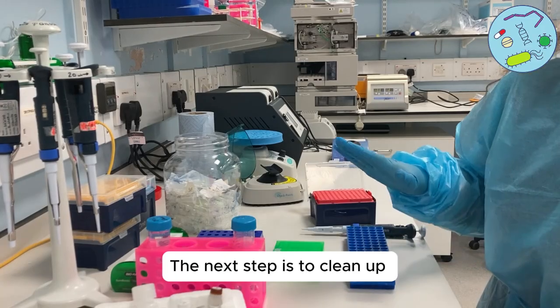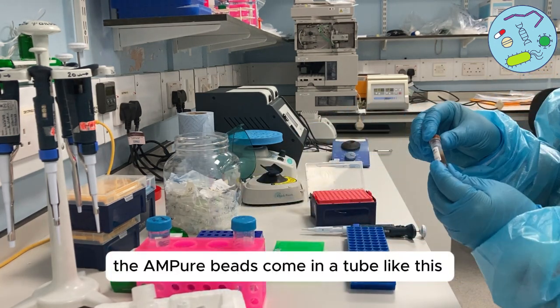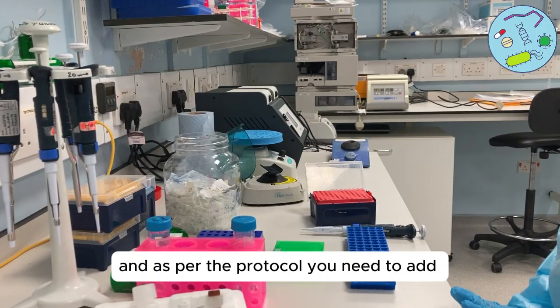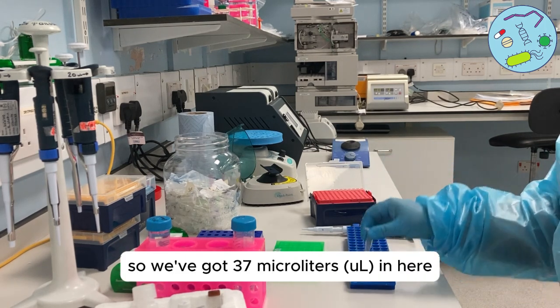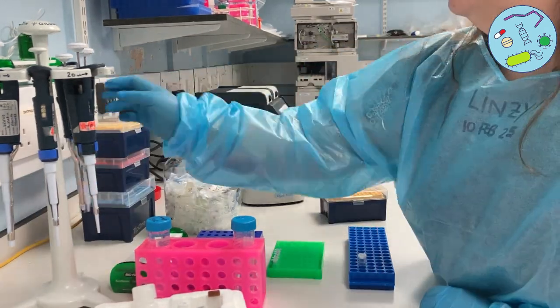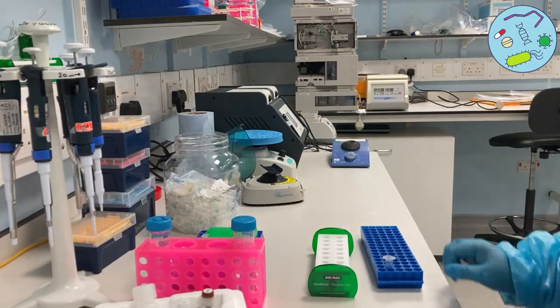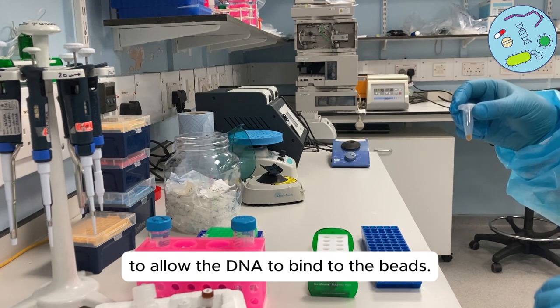The next step is to clean up our pool using AMPure beads. The AMPure beads come in a tube like this — we need to make sure that they're very well mixed. As per the protocol, you need to add 0.6 times beads compared to the volume of your pool. We've got 37 microlitres in here, so we need to add 22.5 microlitres of beads. This needs to be incubated on a hula mixer for five minutes at room temperature to allow the DNA to bind to the beads.